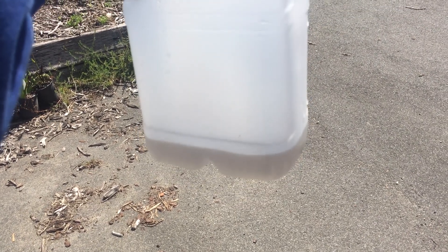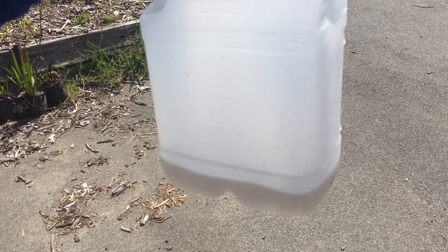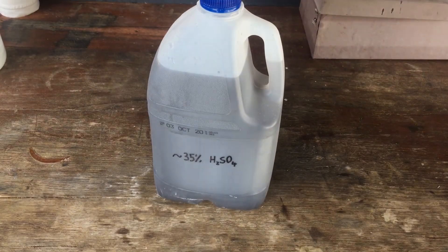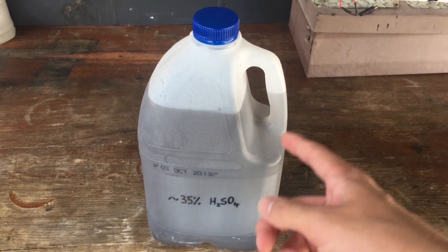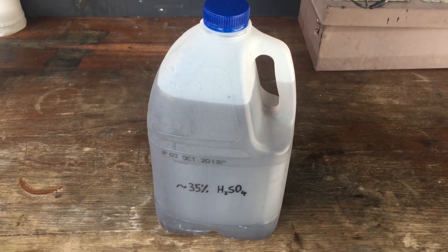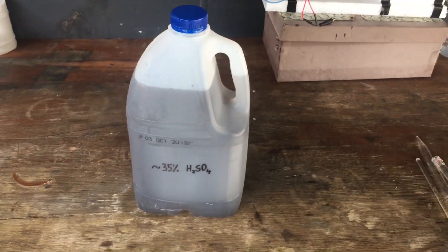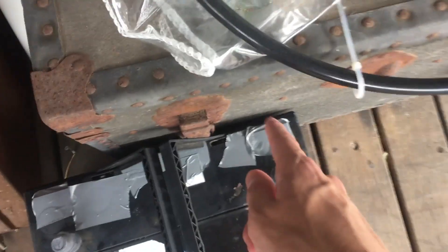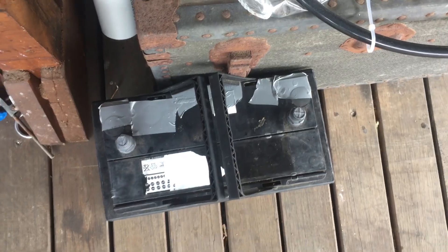That is what we get from one of the six cells. To get the acid out of the other five cells, I ended up just drilling a few holes so that we could pour it out. And that is what we got from the whole battery — that is nearly three litres of our 35% sulfuric acid.